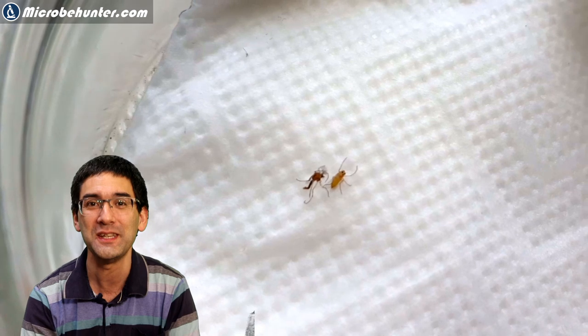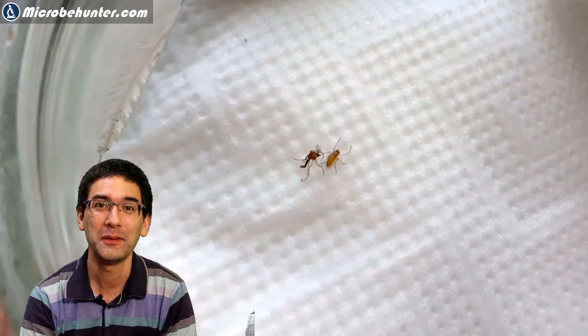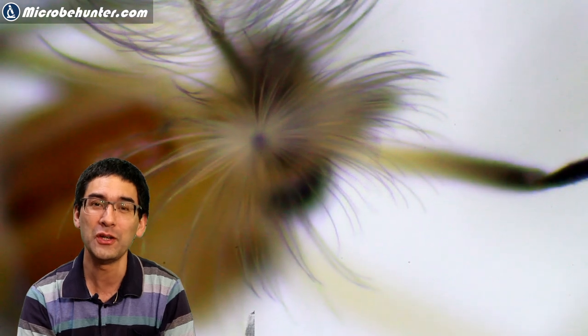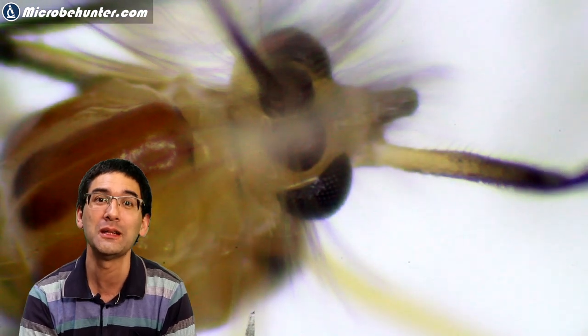Unfortunately, one of them flew away, but the other—there was a second insect which wasn't a mosquito—but there was one mosquito. I immediately put it under my stereo microscope.